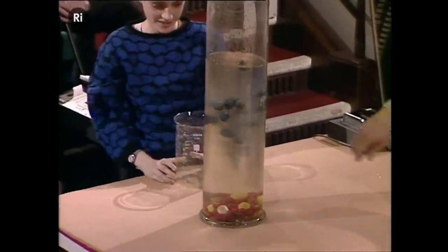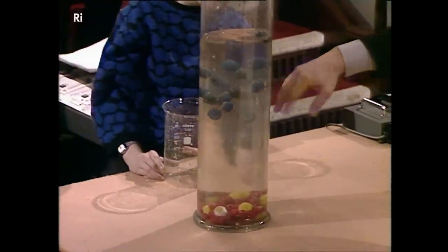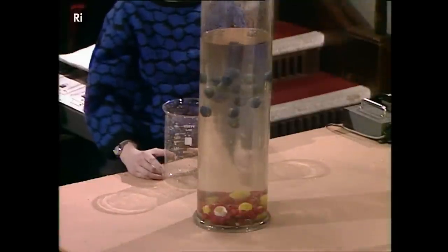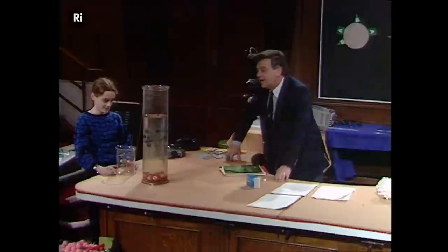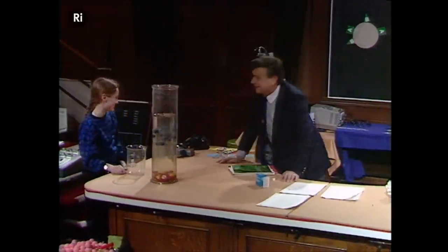You see what happens? The white cells, they stay up above. And the red cells, they've gone to the bottom. We've got a salt solution in there that's just right to separate the white cells from the red cells. Thank you very much, Helen.